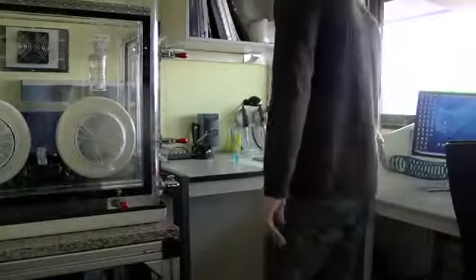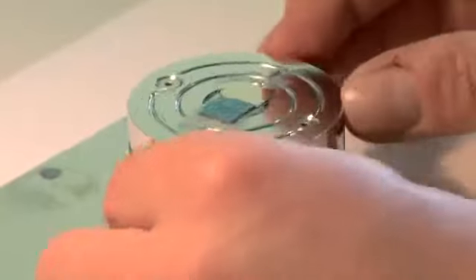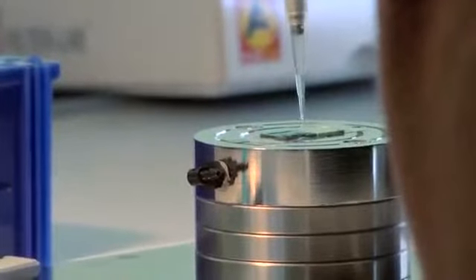Recently, though, they have used a powerful technique called Dip Pen Nanolithography, or DPN, to control the deposition of the basic seed material on a growing surface. Dip Pen Nanolithography allows us to control the miniaturization and positioning of these less than femtoliter droplets. There are almost no other techniques with which you can direct write liquids or nanodroplets on a surface at the nanometer scale.